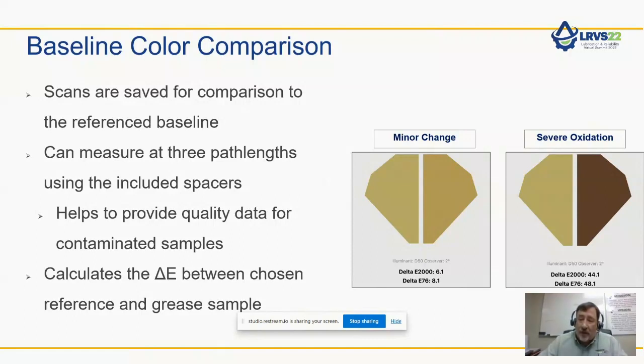We have a delta E of 44. So over time, you'll develop criteria that says these greases are all fine. They get a little bit darker in service, but when they exceed a certain value. And so, for instance, for robots that are a great palette as far as that goes, because it's typically a very light tan grease like you see here, we've established a criteria of delta E of 15. And those of you who have worked with the CIE values in MPC testing know what that delta E value is. We can apply it here as well.